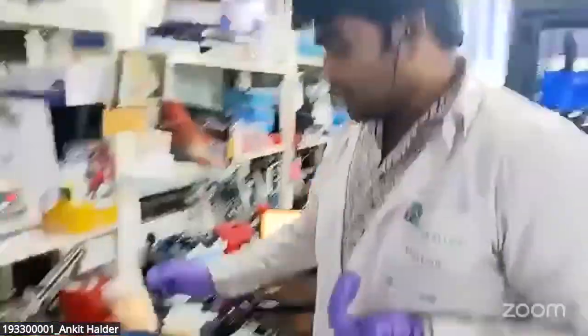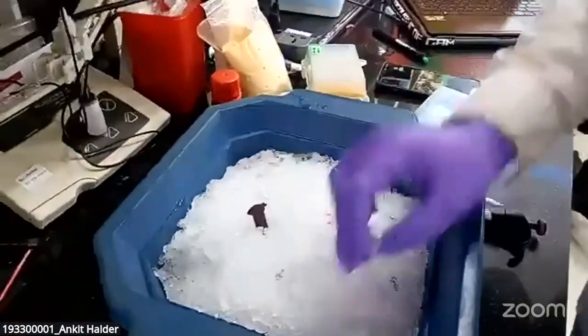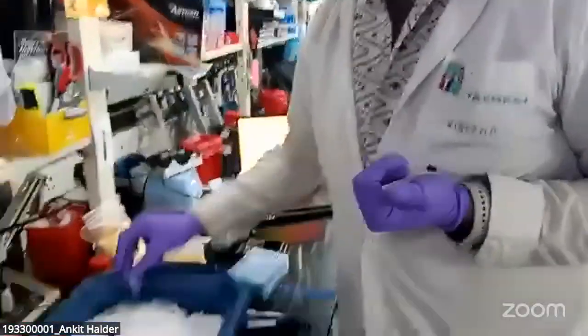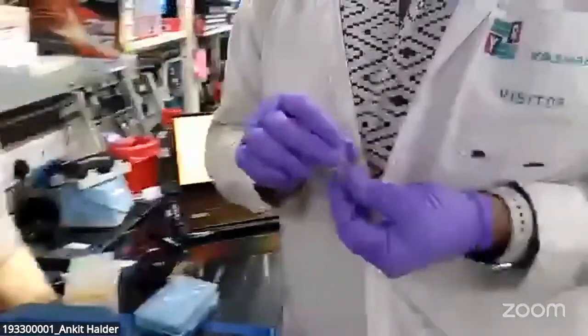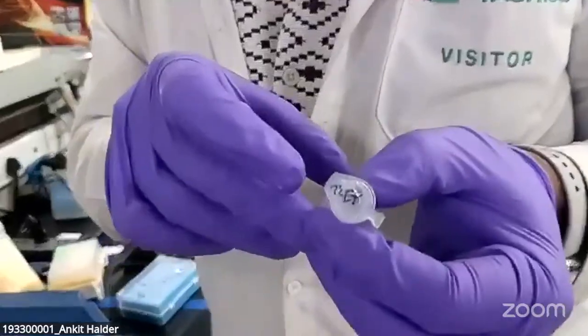Before starting the protein digestion, you need a few important ingredients that will help in your digestion. The very first important thing that you need is the buffer B. So this is the buffer B. Actually, you need to make up the volume for the buffer B. Now you need to use the TCEP. TCEP is an important reagent that will basically break the disulfide bonds.